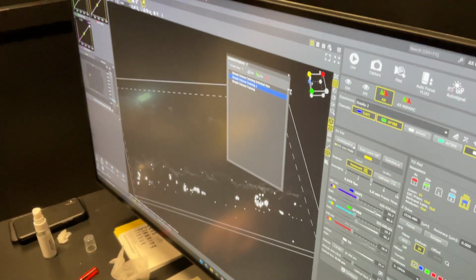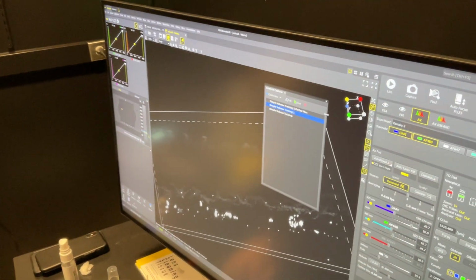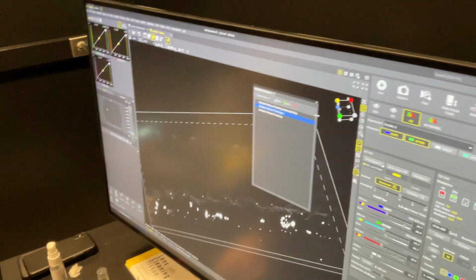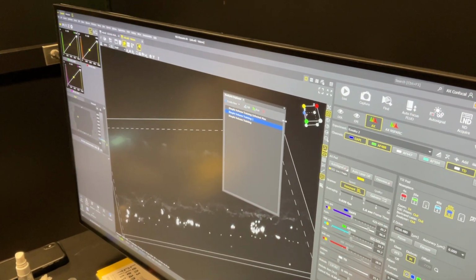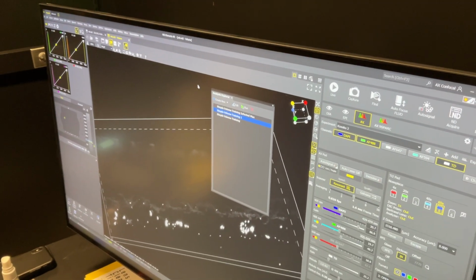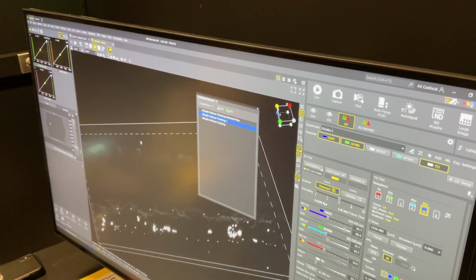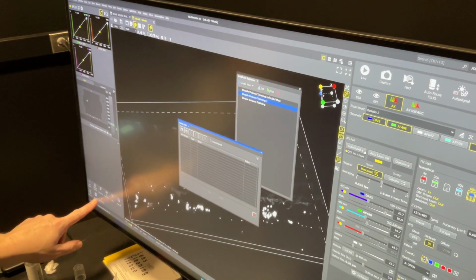If you're working on it and you need more help, just let me know. If I can't figure it out, I go back to the software team. Maybe the final thing for me is that usually per experiment I have 40-ish images, so I want to apply this in batch. The batch tool is down here.